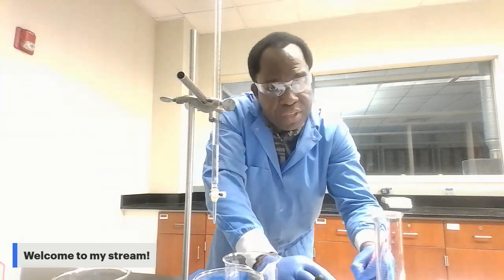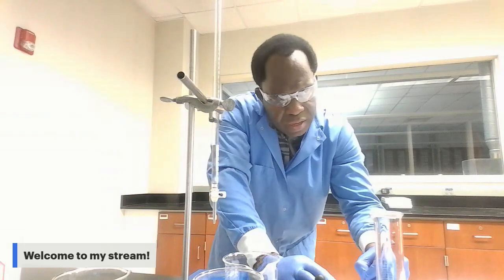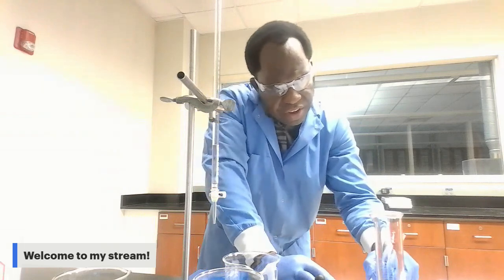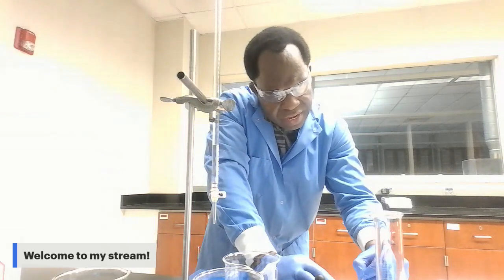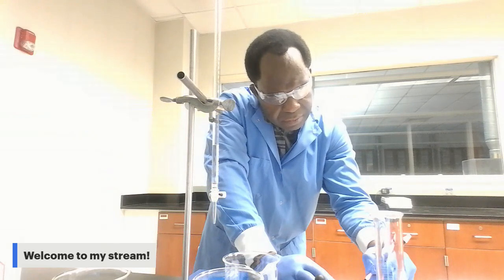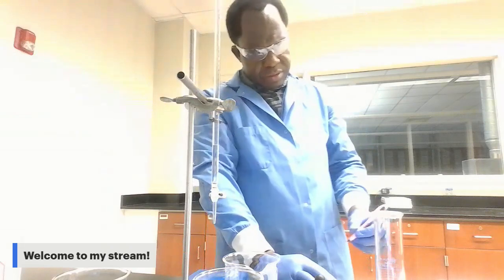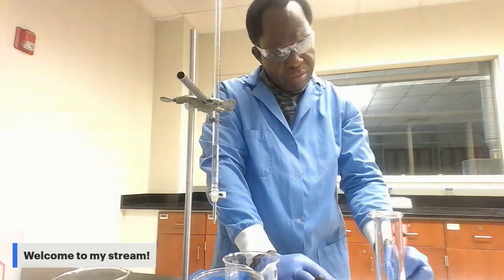Now, if we do 43.5 minus 29 milliliter, we're going to find 14.5 milliliter.